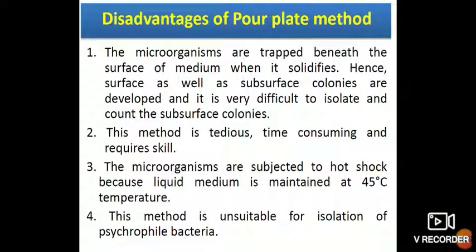There are certain disadvantages of pour plate. Most probably the microorganisms are trapped beneath the surface of the media when it solidifies. When we mix the media with the culture and pour it on the plate, there is a chance of the microorganisms settling down in the plate. That is one of the disadvantages. We cannot isolate properly. Then the method is tedious and time consuming.